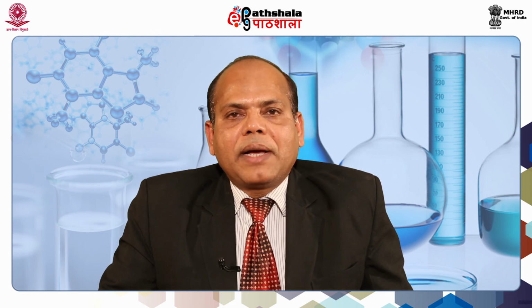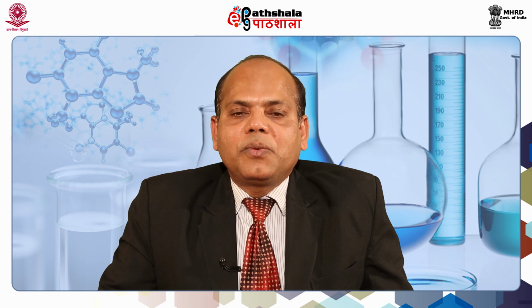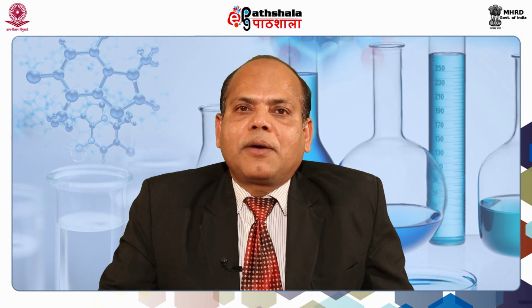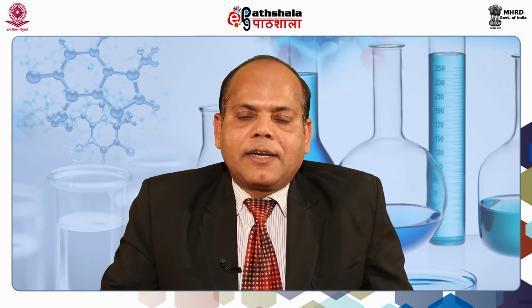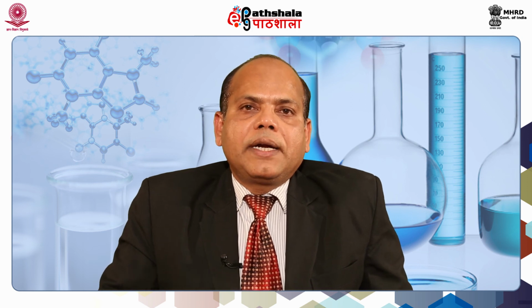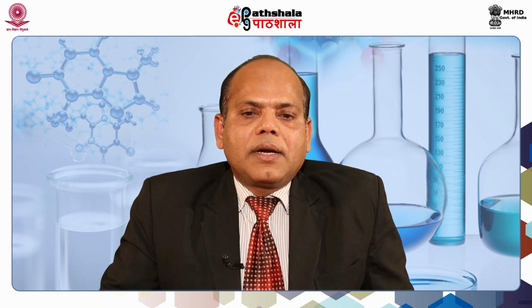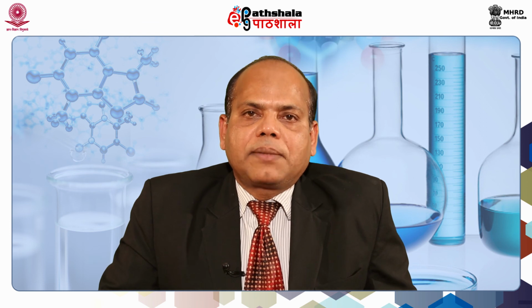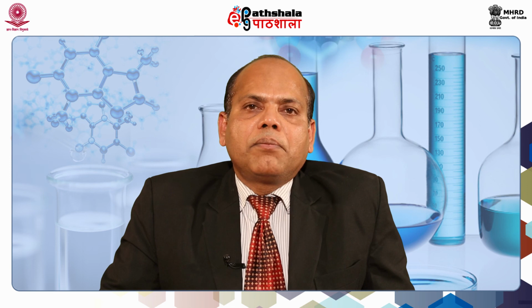So, when you have so many mass spectra, you will be simply confused about what to do with them. So, what do we do? We have to use various softwares. There are inbuilt softwares these days which deconvolute these mass spectrometric data into different masses. Suppose one particular molecule or a mixture of various molecules has entered into the mass spec. They get differentially charged. They may be monoisotopic charged, they may be multiply charged.